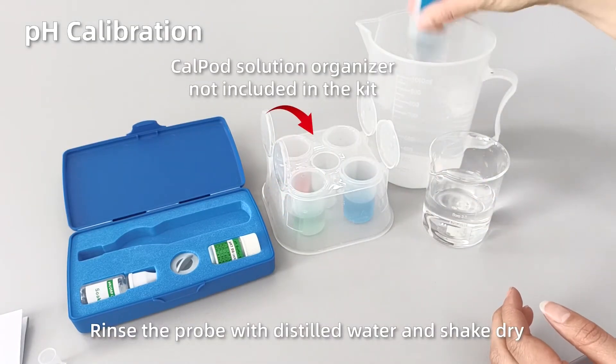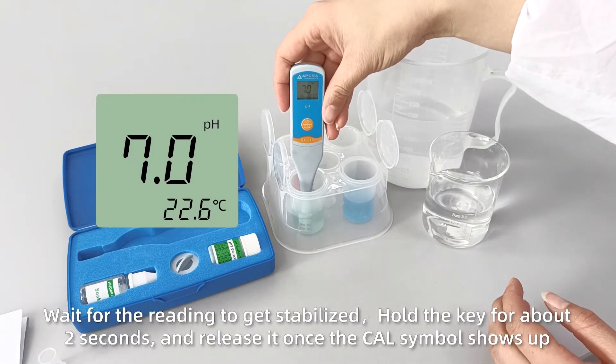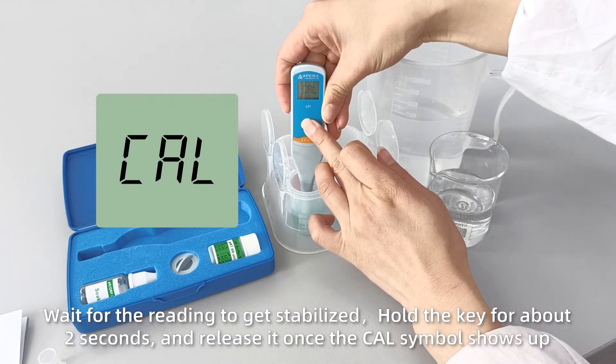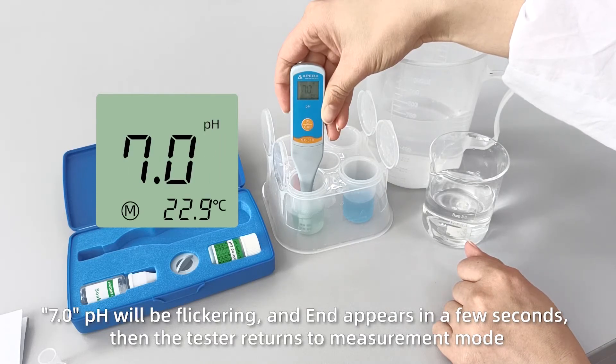PH Calibration: Rinse the probe with distilled water and shake dry. Insert the probe into the PH7 buffer solution, make a quick stir and hold still. Wait for the reading to stabilize. Hold the key for about 2 seconds and release it once the Cal symbol shows up. 7.0 PH will be flickering, and 'end' appears in a few seconds, then the tester returns to measurement mode.